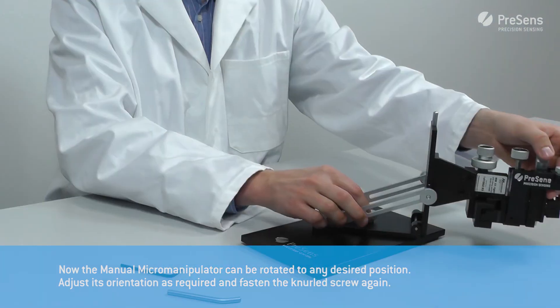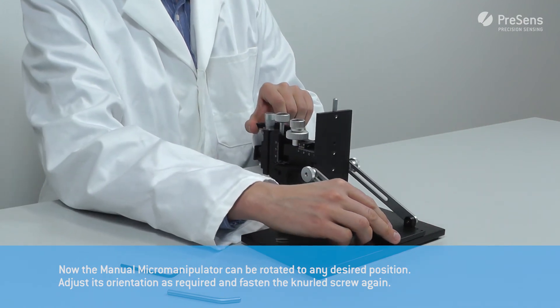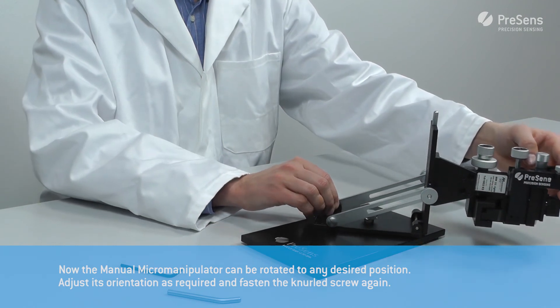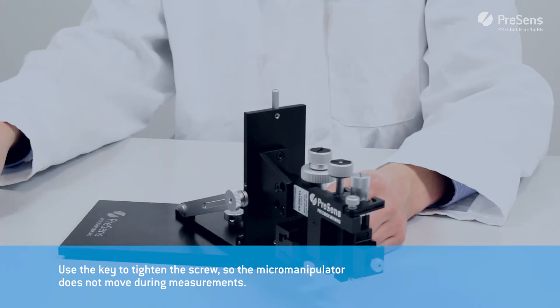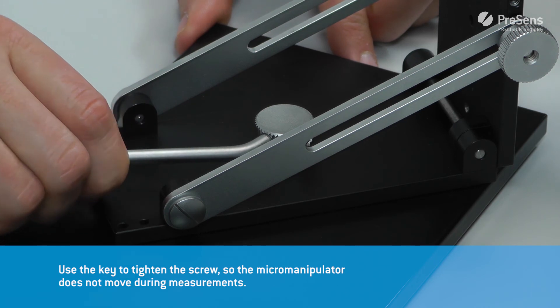Now the manual micromanipulator can be rotated to any desired position. Adjust its orientation as required and fasten the knurl screw again. Use the key to tighten the screw so the micromanipulator does not move during measurements.